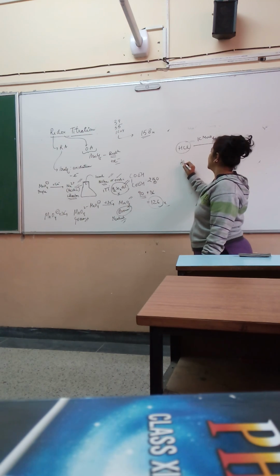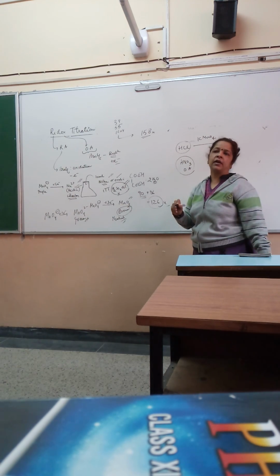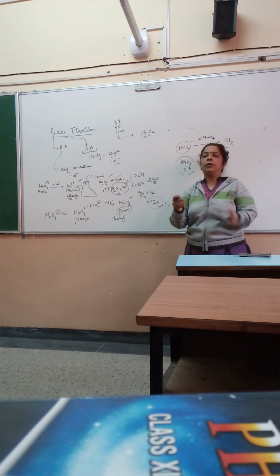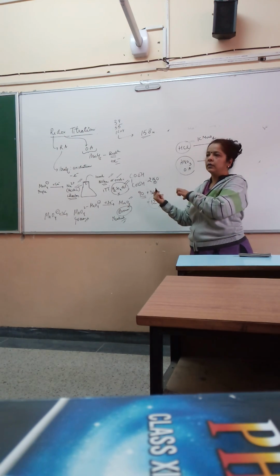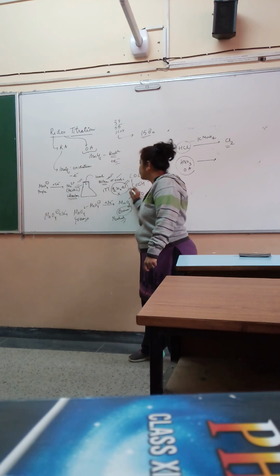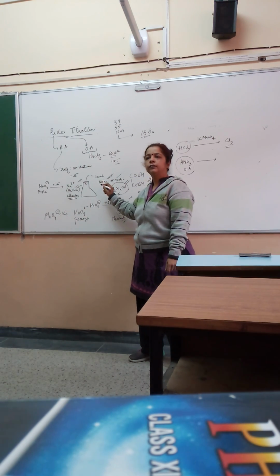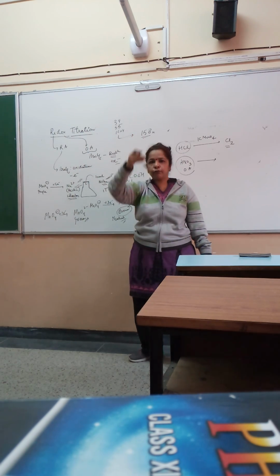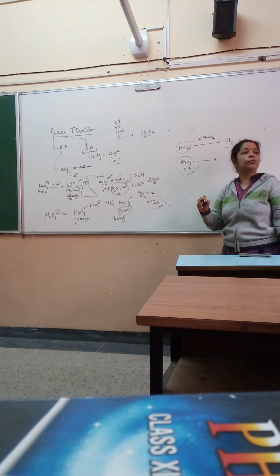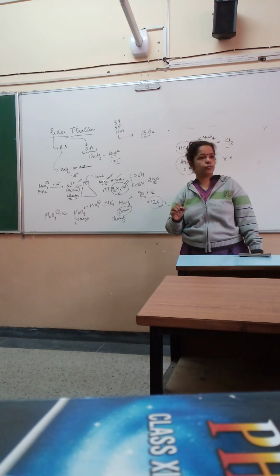In case you add nitric acid, we very well know it is itself an oxidizing agent, so it will start competing with KMnO4. जो काम KMnO4 को करना है वो नाइट्रिक एसिड भी करेगा, which means what? आपके कोनिकल फ्लास्क में मोर सॉल्ट है और उसके साथ तुमने सल्फ्यूरिक एसिड की जगह पर नाइट्रिक एसिड डाला. नाइट्रिक एसिड इसको पहले ही ऑक्सीडाइज करना शुरू कर देगा. The work which was to be done by KMnO4 by addition through the burette has started to be done by nitric acid. So your reading would be low. Hence, this also cannot be used because there is a competition between the two.